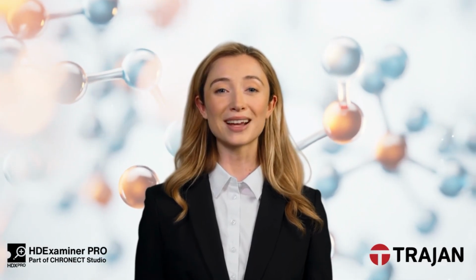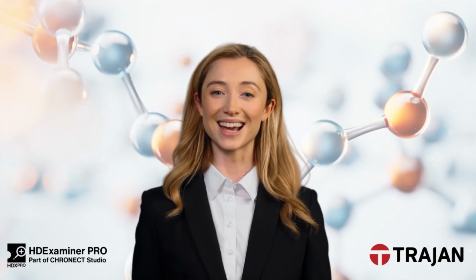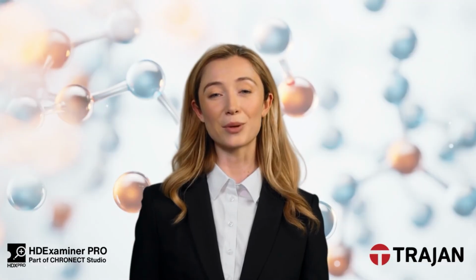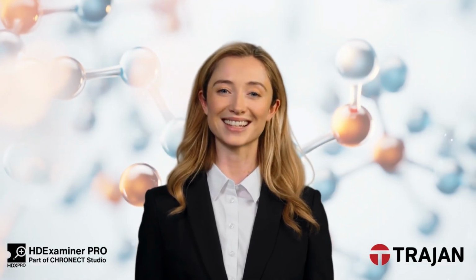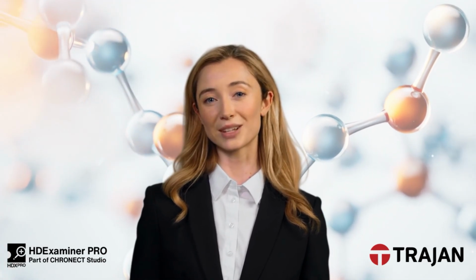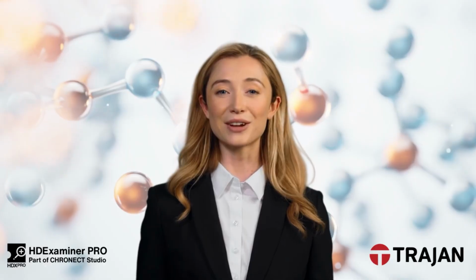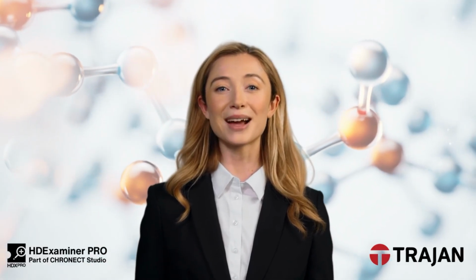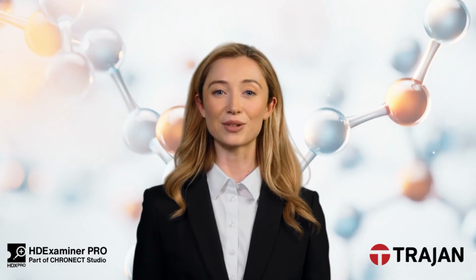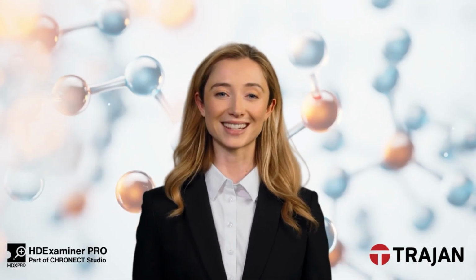We have explored the fundamentals of hydrogen-deuterium exchange, examined MS1 and DIA workflows, and demonstrated how fragment-based validation can transform complex data into reliable insights. Throughout this process, you have seen how advanced techniques help overcome challenges such as overlapping peptides, enhance accuracy, and provide greater confidence in your results. By applying these approaches, researchers can accelerate discovery, streamline workflows, and achieve improved reproducibility in their protein studies.